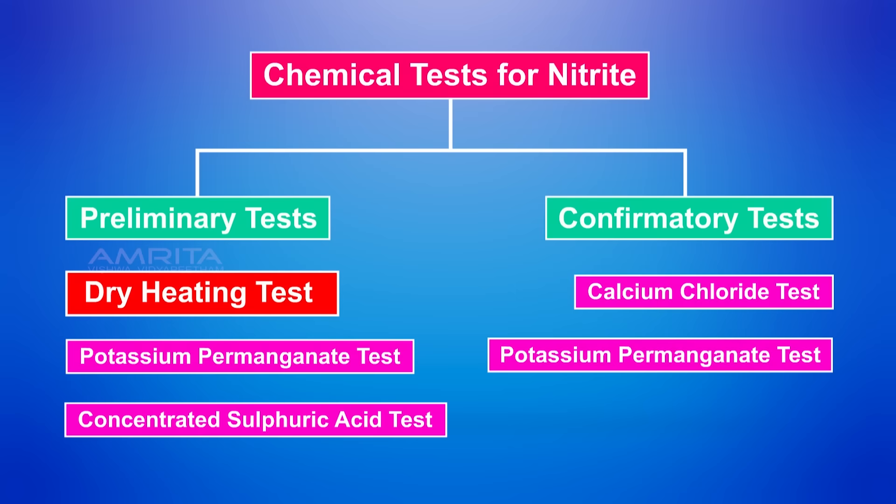Let's first look at the preliminary tests of oxalate. They are: dry heating test, potassium permanganate test, and concentrated sulphuric acid test. Dry heating test.